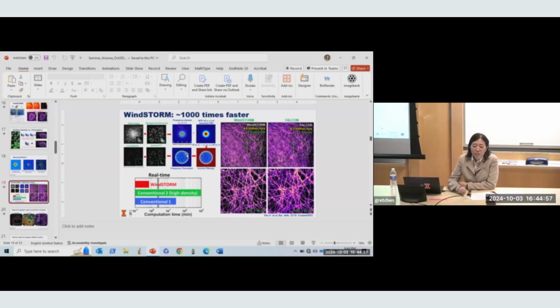So we didn't really go there, and now that I look back, there's probably a better way to do it. The way we did it, we took multiple steps and then automatically refocused to find those regions. But I think there's either some wavefront correction or some deep learning based approach that could be used to make it better. Because we do take, I think, 5 to 10 section stacks.